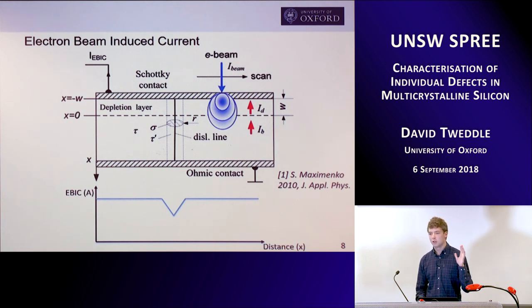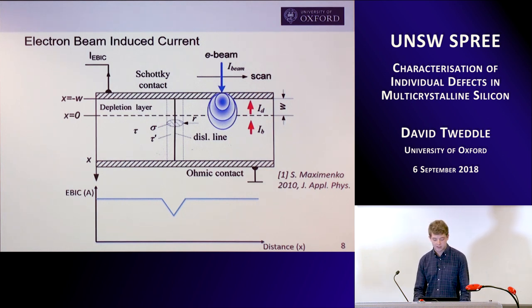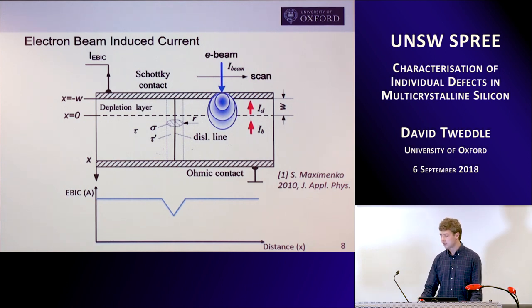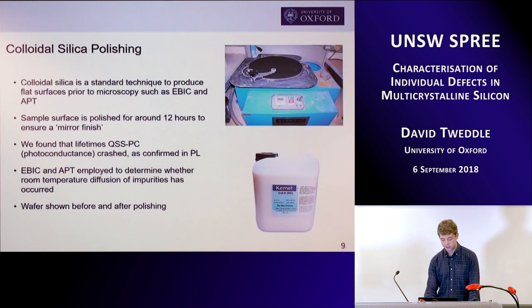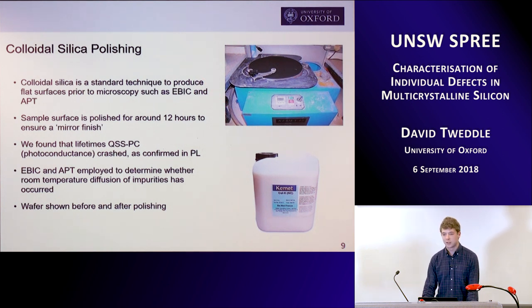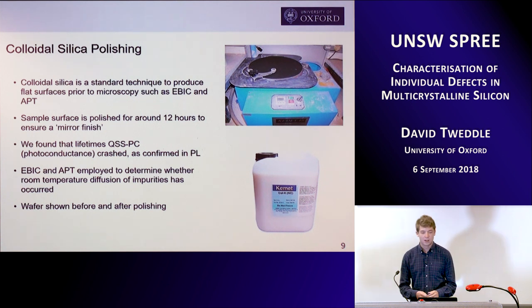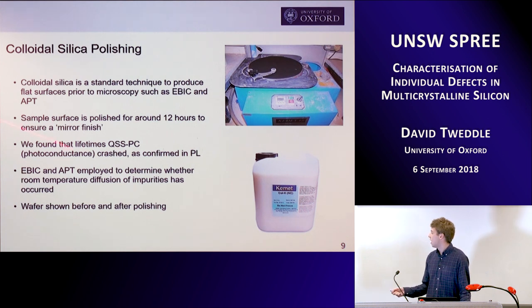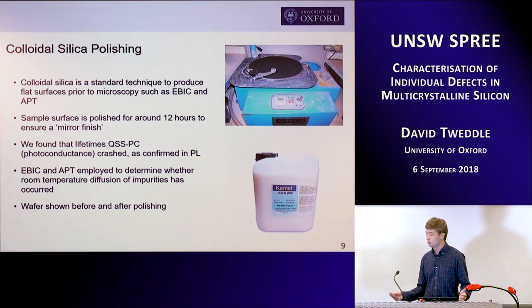In order to do EBIC, you need a flat surface so that surface effects don't influence your measurements. The standard thing that material scientists do is colloidal silica polishing just to get a flat surface. However, when we did this colloidal silica polishing, we found that our lifetimes absolutely crashed and we also got very low counts in PL. We were confused, because this is a really standard technique used in material science. So we used EBIC and Atom Probe to see what was actually going on.